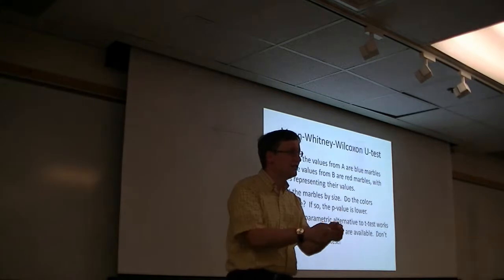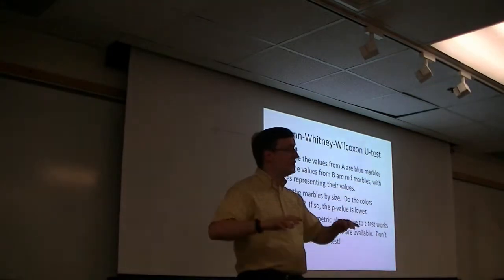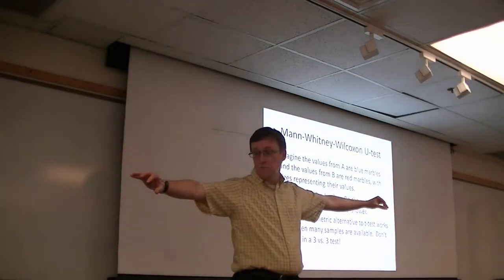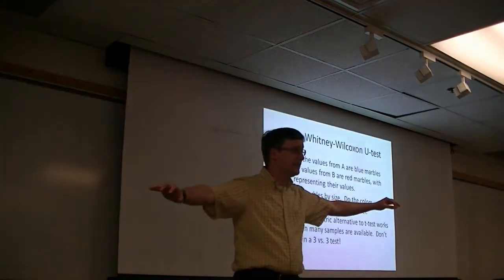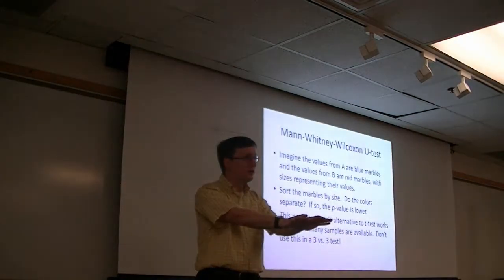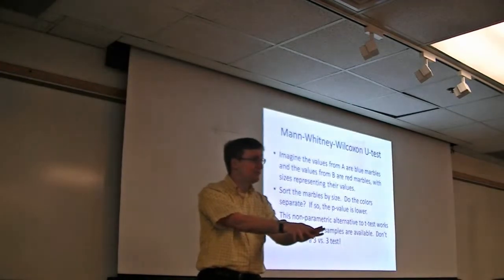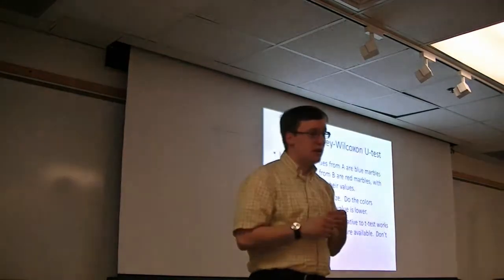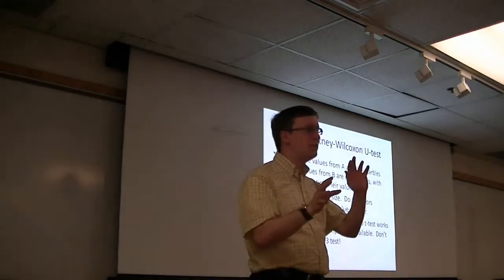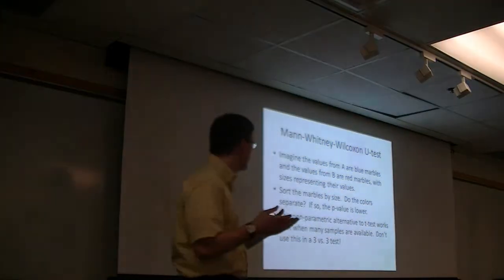So, does it matter in a Mann-Whitney test if all of the reds are way over here and all of the blues are way over there? Not really. That gives you exactly the same p-value as if they're right next to each other. It's the mixing that leads to that p-value going up. So, as we move forward, you should keep in mind that difference between a parametric and a non-parametric assessment of differences in these two distributions.